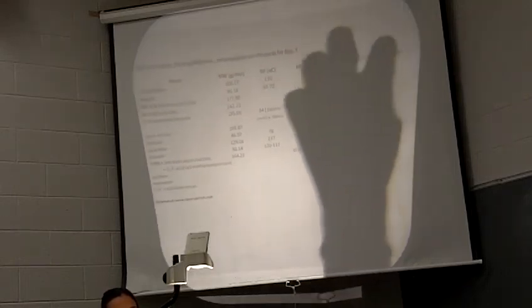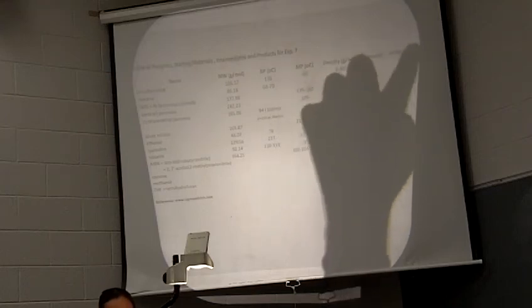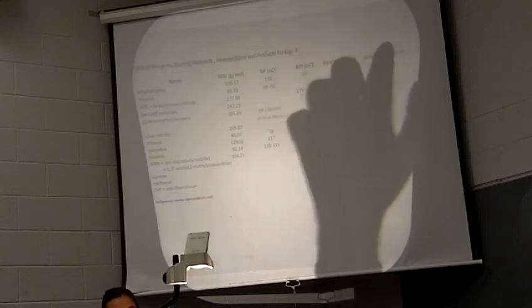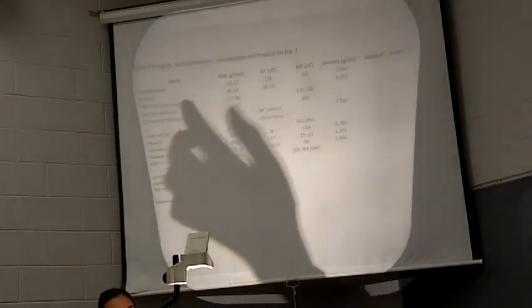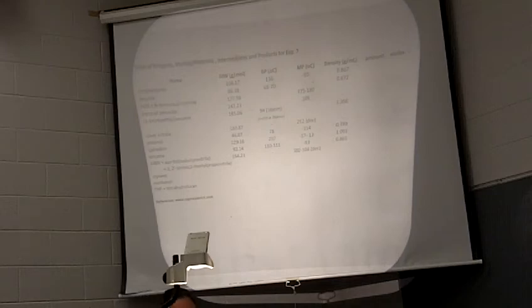And then over here, in the amount in moles, none of that has been filled out, okay? So based on what your instructions and your lab manual say, you're going to figure out how much to use, and then based on that, you'll also figure out how much you're going to produce, okay? So I'll leave that there for a second.